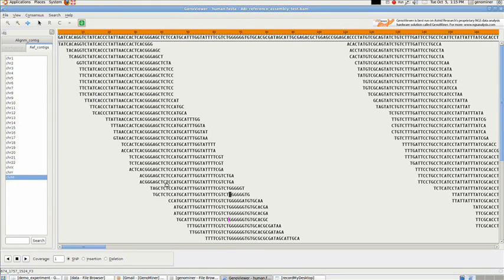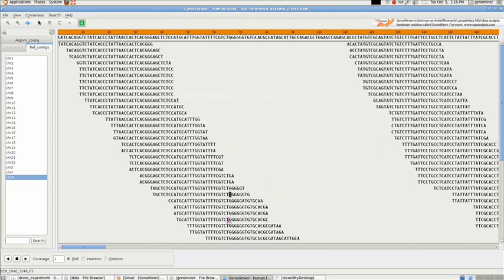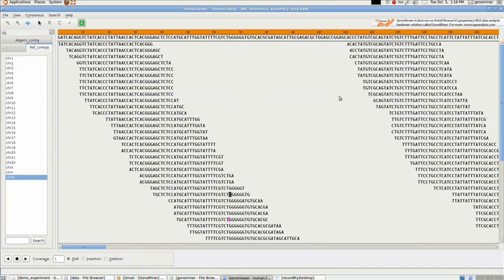Scroll through the chromosome to click the aligning reads, mismatches, SNPs, and indels. After clicking on a read, a pop-up window displays the alignment of the selected read to the reference sequence. Options displayed in the bottom left corner of the window can help you find the SNPs, insertions, and places of deletions. GenoViewer allows you to generate the consensus sequence and mutation tables with all the detected polymorphisms and indels and then export them into a new folder.